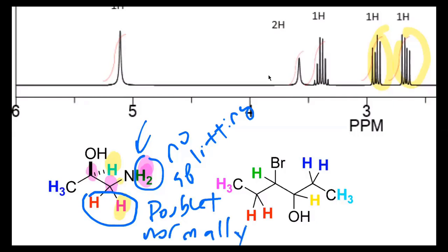So you only split between carbons? You're not doing any other atom? No, what I'm saying is that the NH2 protons don't couple. OH protons don't couple, so you don't count them. If you're looking at a set of hydrogens and it's next door to an OH or an NH2 or an SH or any heteroatom, you don't count those as neighbors because they're not going to split. So normally that would be a doublet. Does anybody disagree or still not see it?